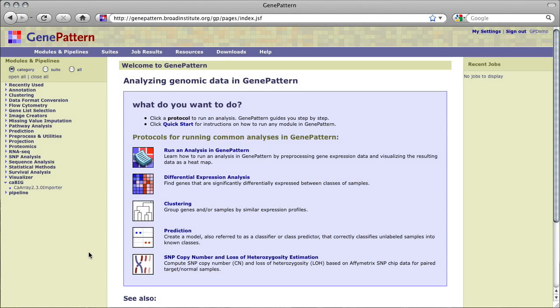To facilitate the importing of data from CA Array repositories into GenePattern, a module named CA Array 2.3.0 Importer is provided.